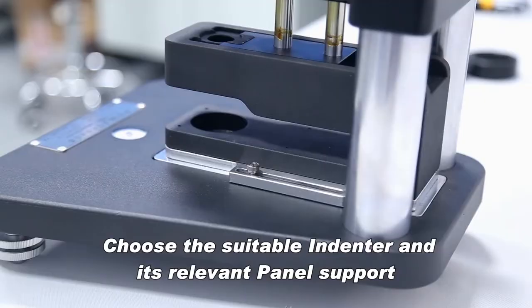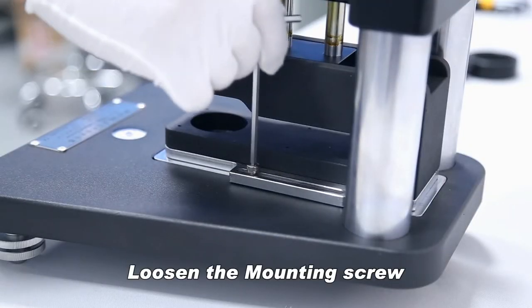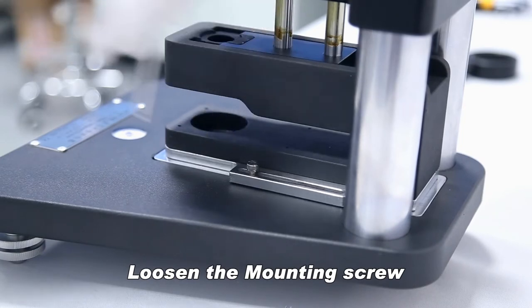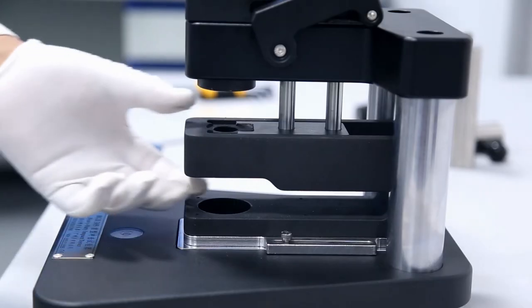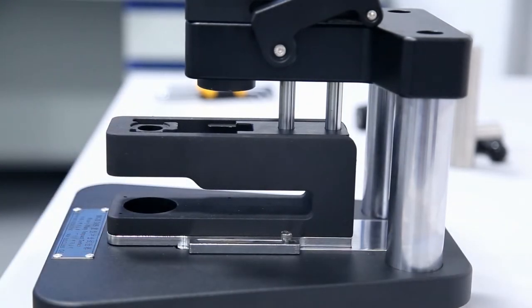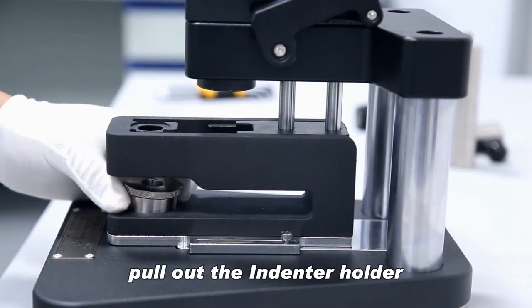Choose the suitable indenter and its relevant panel support. Loosen the mount and screw, then pull out the indenter holder.